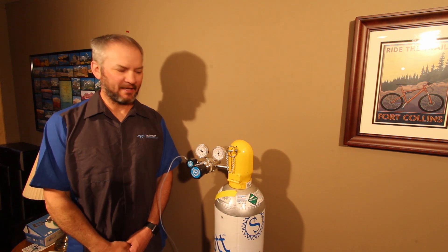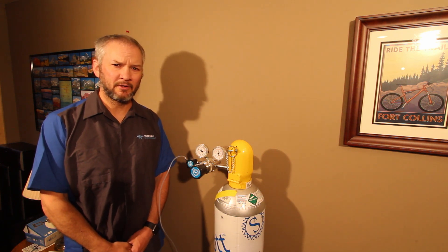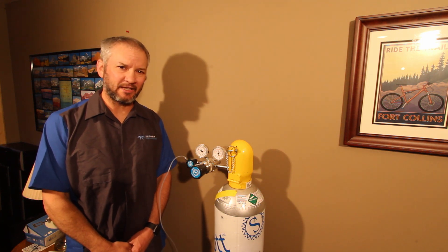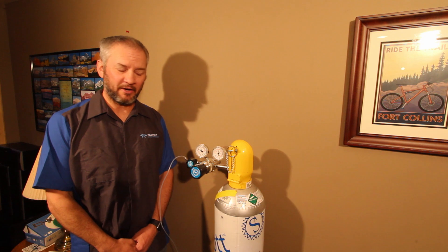Hi, I'm Brian Bebo with Teledyne API. Today I wanted to go over with you some tips and tricks on proper purging and cleaning of your regulators for ambient air monitoring.